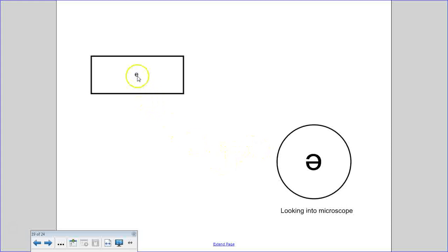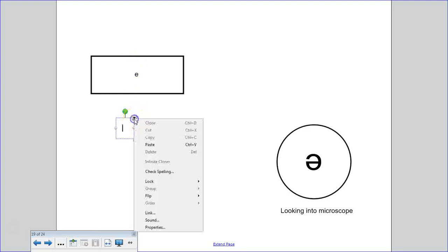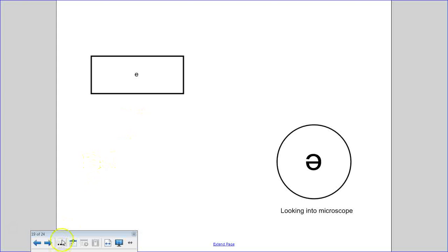Then it asks you, okay, well, I want you to move, oops, what's happening there? What now? Okay, then I want you to move your E. What happened to my E? I don't need that anymore. Oh, I know something. I'm sorry, I need to go back to select. There. Alright.